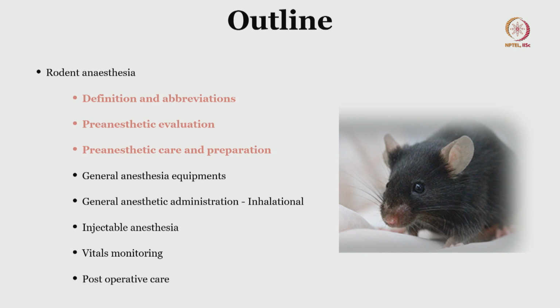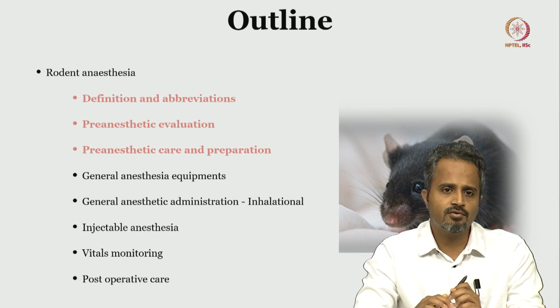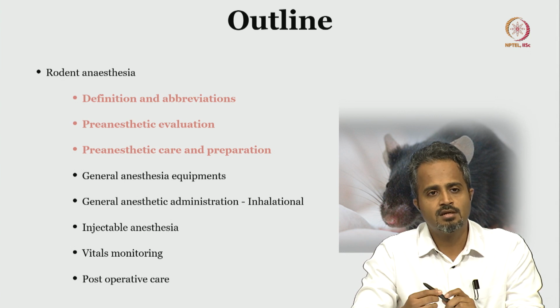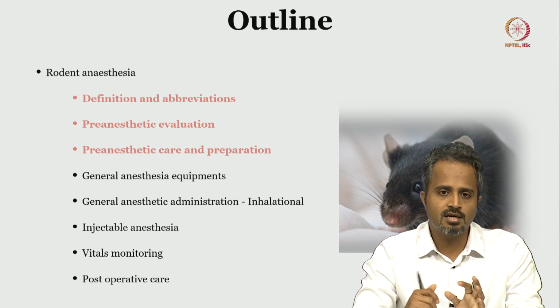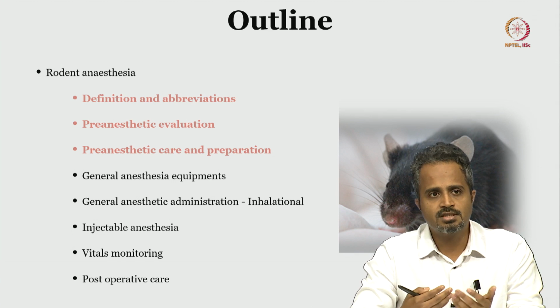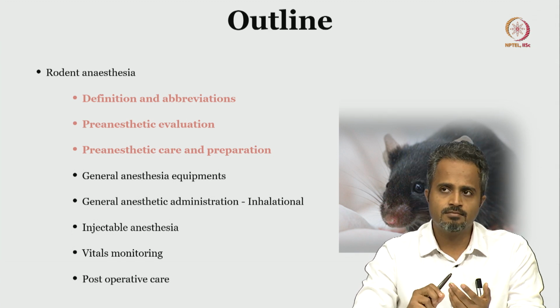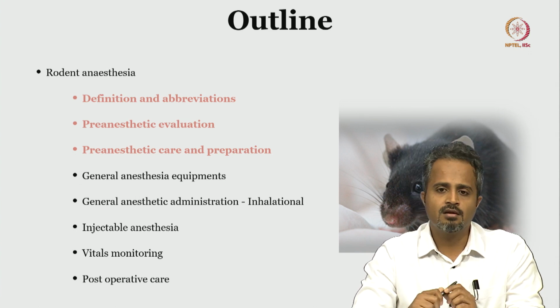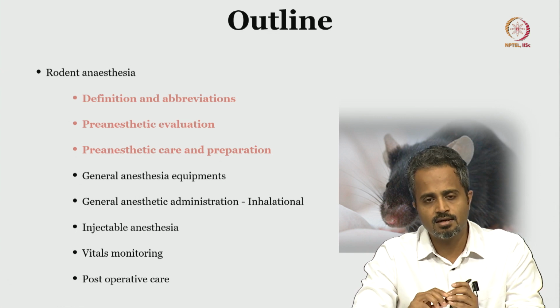Whereas here you really have to remember a lot of such terms, and if you are not really familiar with these terms, it's going to be really disastrous, because any mistake in the dose calculation or miscalculation of the drug timings, or if you choose a wrong drug and administer it in a wrong way, instantaneously it will kill the rat.